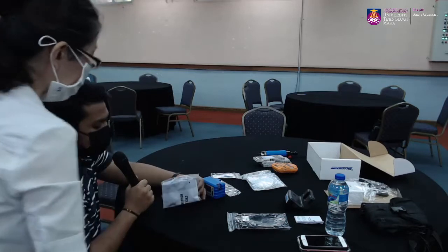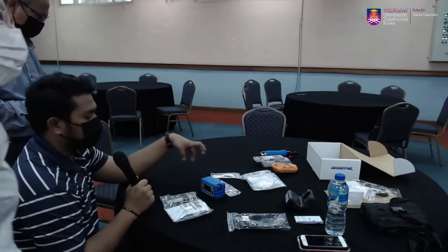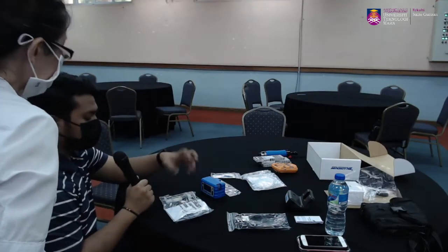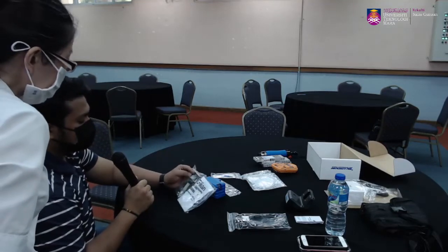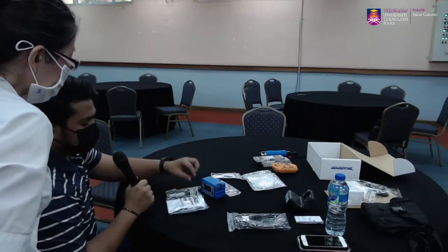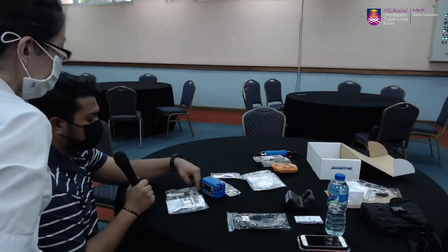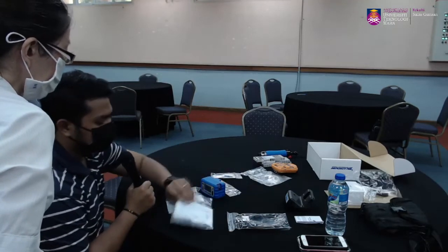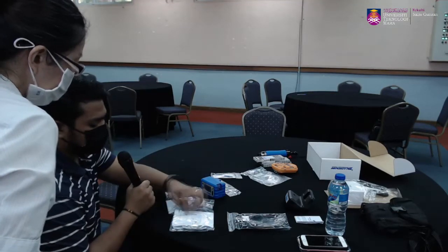So it shows a picture of how to connect. Usually the picture is inside here, so we can refer to it. Or if there is no diagram, I can go through the assembly with you. But it is quite easy. We just pull this apart, put the cassette in between, and then insert our tubing at the top through the inlet of the cassette. In the picture, the cyclone has a top part and a bottom part.